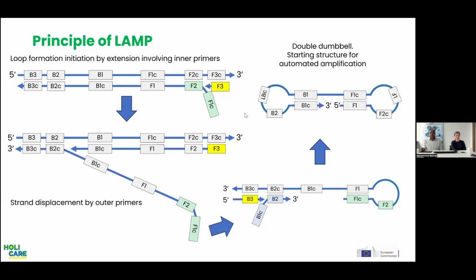And as I mentioned, that enzyme is now able to nick out the previously built strand and to build a new strand. As I'm showing here, this is the extension of the F3 primer and nicking out of the previously built strand with the FIP primer.